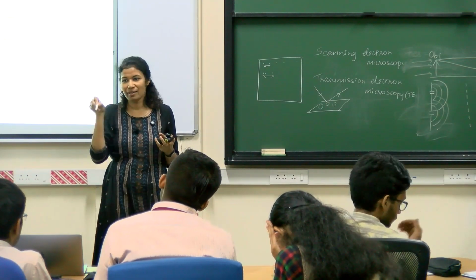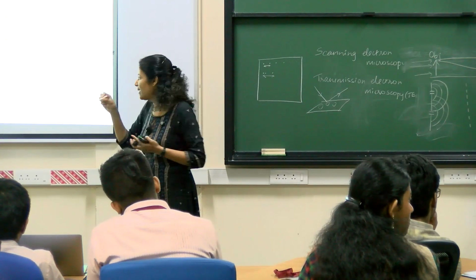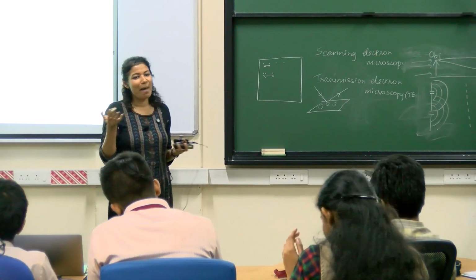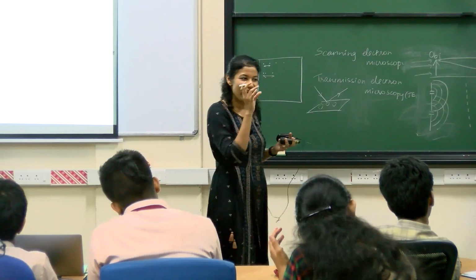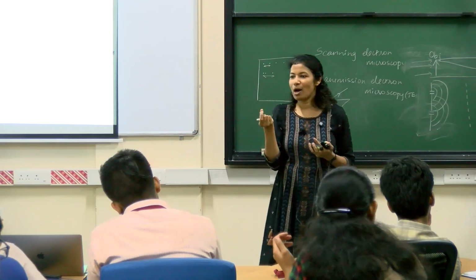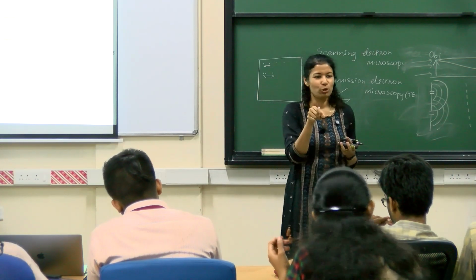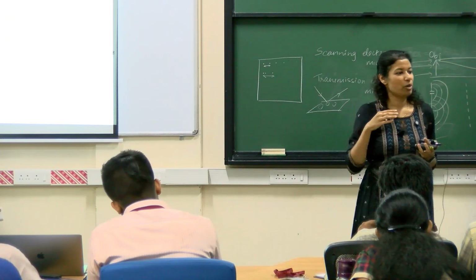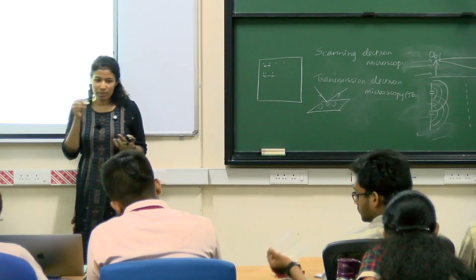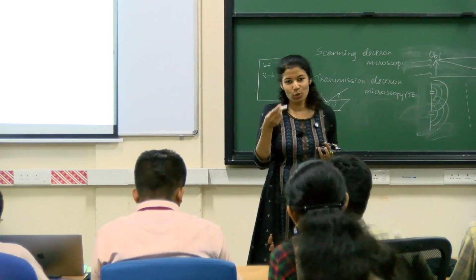Even that small thing, inside it there are squares. It's a small metal grid that is fabricated, on which there are squares. Inside each square there are holes where your sample is actually suspended. So that is the level you are looking at even for sample preparation. You need only microliters of sample, very, very little, that you put on it, and that can be mounted on the microscope. You can't see the holes like this. I need a microscope to show you what looks inside it.